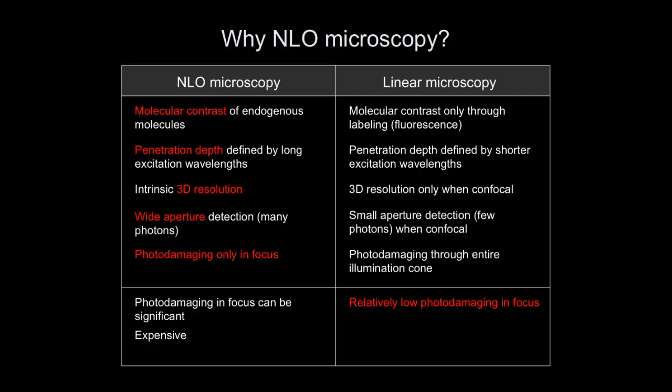Of course, nonlinear microscopy, this word is much more difficult than this word, which means you have to pay a price. Money. It's more expensive. And the linear microscope is much, much less expensive. Okay, so that is actually an important consideration.